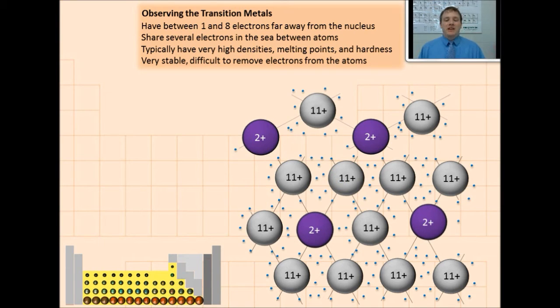What's going to happen is some of the zinc atoms are going to mix into the copper, and some of the copper atoms are going to mix into the zinc, and we're going to end up with a solution or an alloy known as brass. We're going to see that the silver-colored, zinc-coated penny is going to change gold at the end because the atoms aren't chemically reacting. They aren't changing to completely different substances. They're just going to mix together.